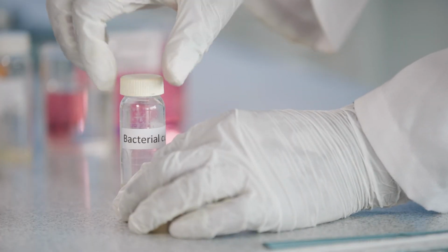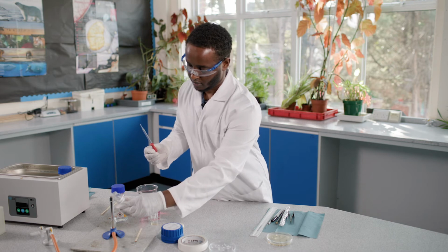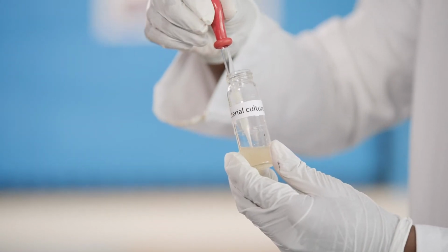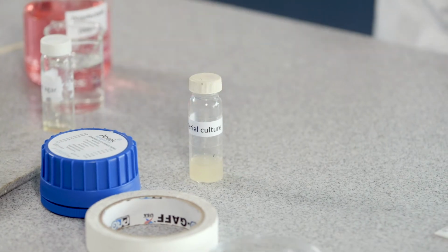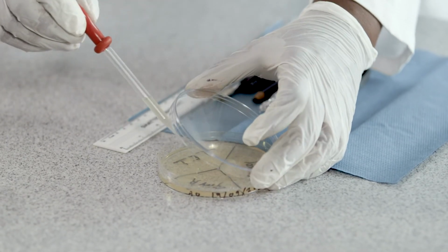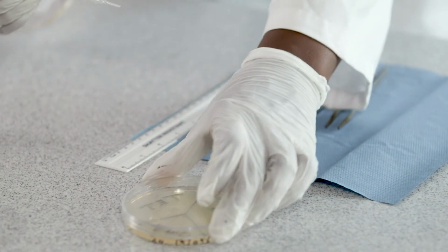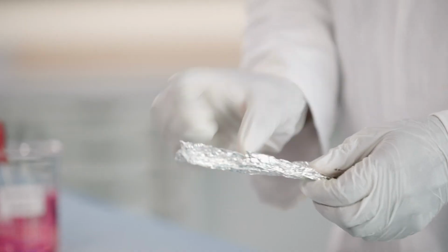Unscrew the cap of the bottle of bacteria culture and quickly pass the neck of the bottle through the Bunsen flame. Draw a small amount of culture into the pipette, then flame the neck of the bottle again and replace the lid. Lifting the lid of the Petri dish as little as possible, gently add a few drops of culture to the agar. Replace the dish lid and place the pipette in a disinfectant.